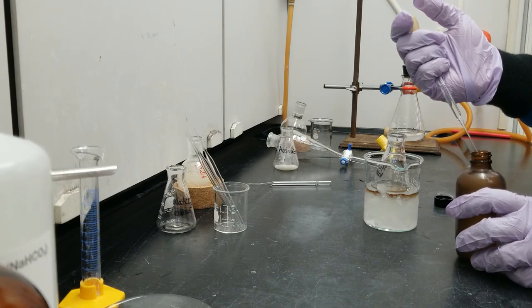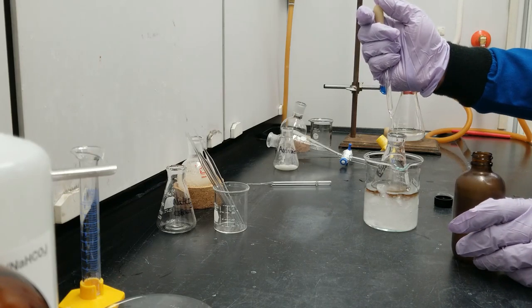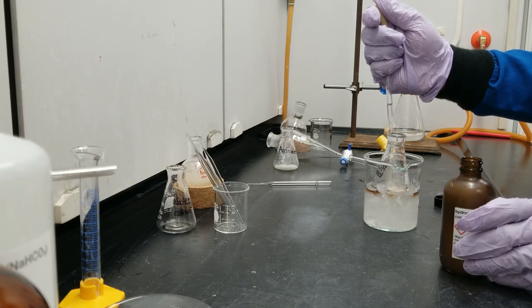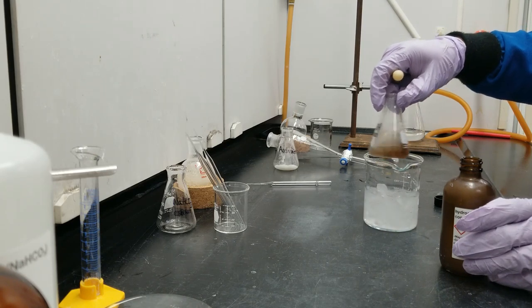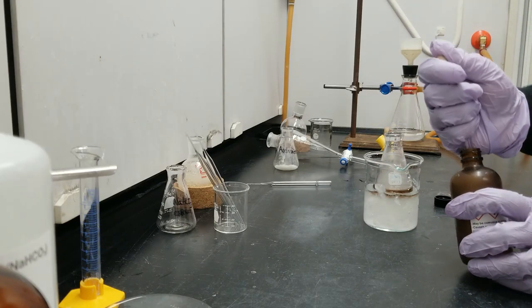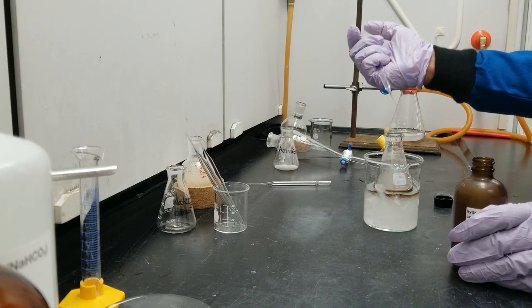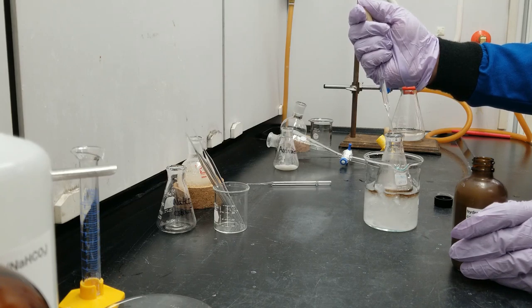While adding hydrochloric acid, always remember to add it dropwise because this time we are adding it to sodium hydroxide solution, so there should be no effervescence. But last time we added this to a bicarb solution, where you get carbon dioxide coming out of the solution.